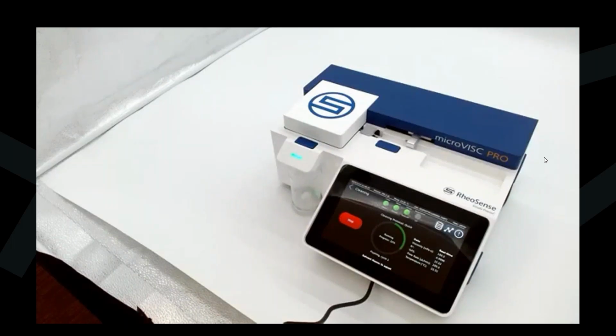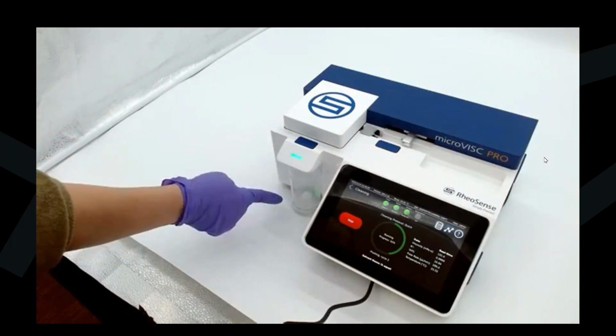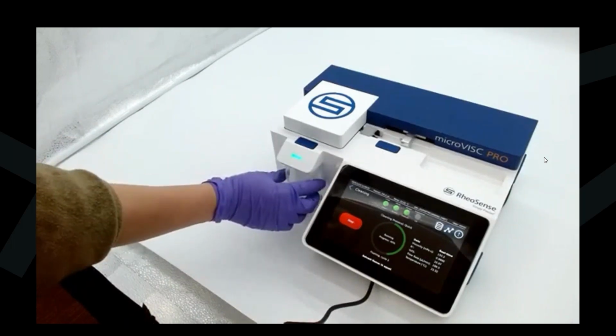So it pushes the sample, it soaks for a predetermined amount of time, and then it pushes again. And this is specified based on the cleaning protocols or with the custom mode cleaning protocol. So we can see the sample is being pushed and it's being directed into the waste container on the left.